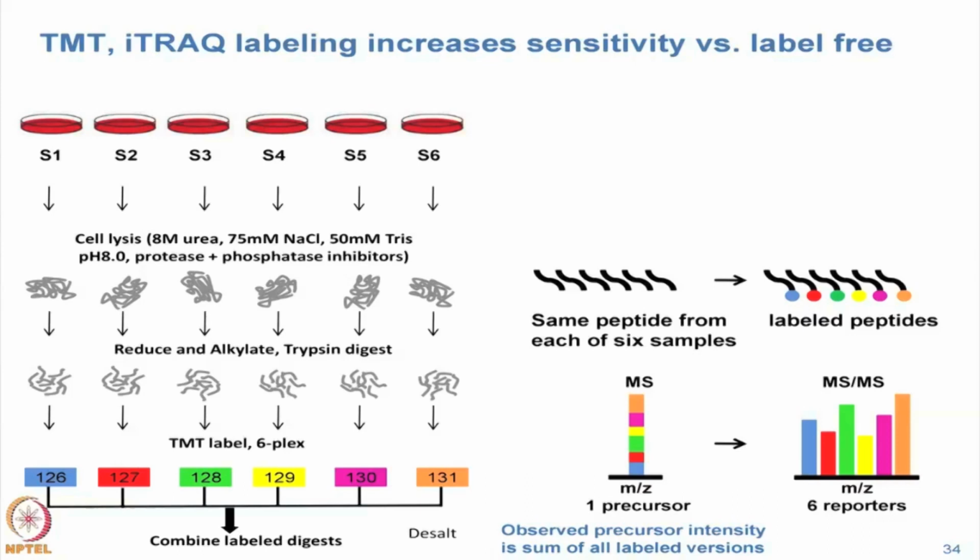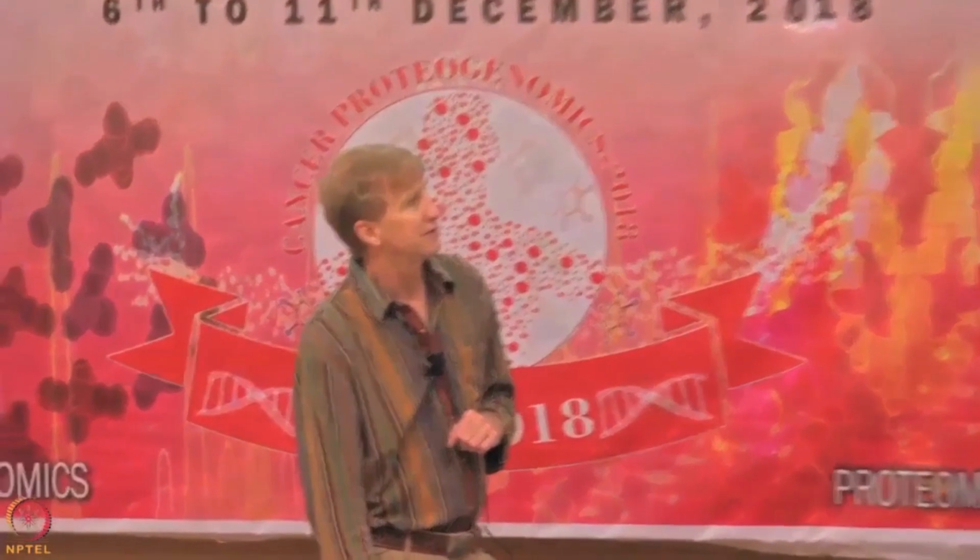After you have peptides, you use the TMT labeling agent. These are amine chemistry based reagents, so they put a label on the side chain of lysine and on the N terminus of the peptide. The reagent normally comes in 6 colors. These are actually masses, and the masses shown here are the reporter ion masses that are present in the MS/MS spectrum.